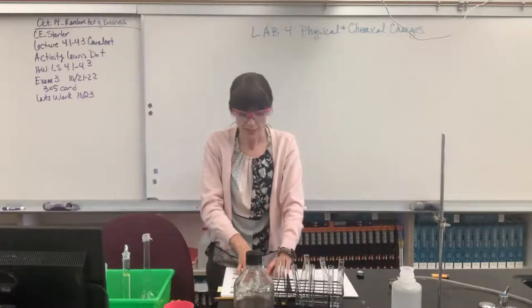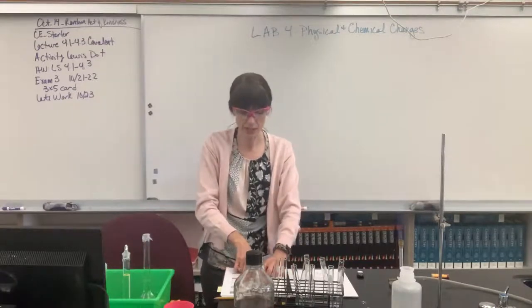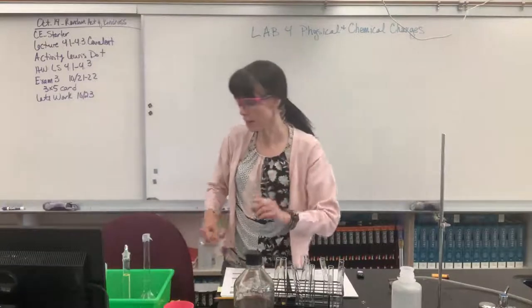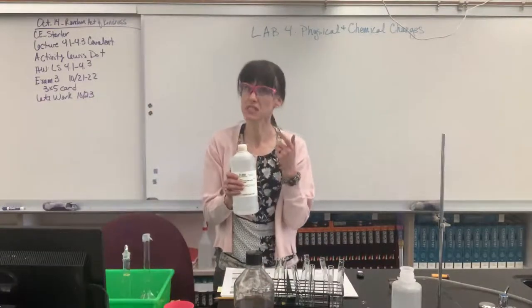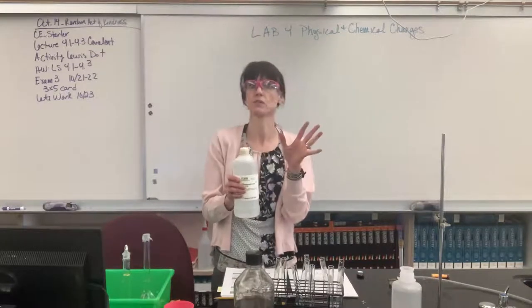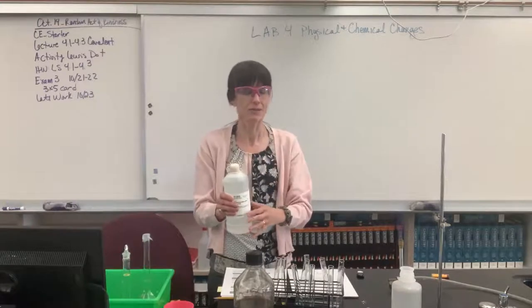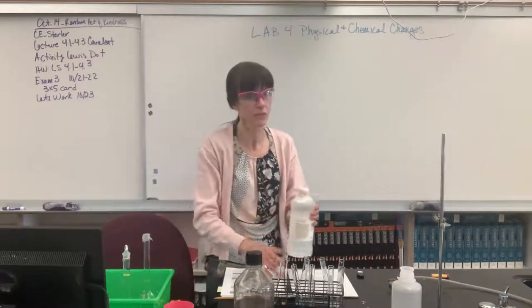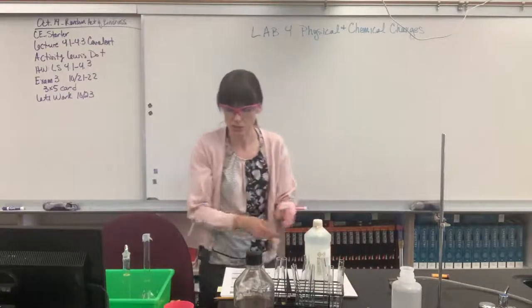It says test the sample in 1 test tube by adding 15 drops of dilute 6-molar hydrochloric acid. Don't be fooled by that word dilute. Here, 6-molar HCl can still do serious damage. You are always respectful of acids and bases. They are highly corrosive. So it says dilute. Yes, is it dilute by 50%? Yes, but it can still do considerable damage.